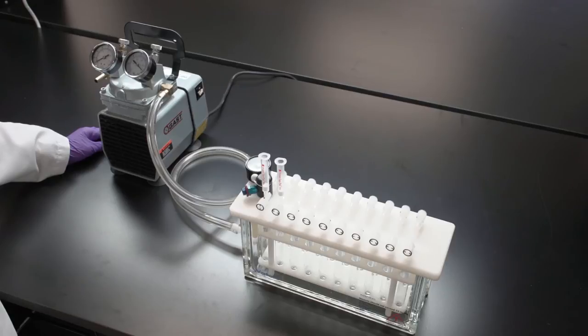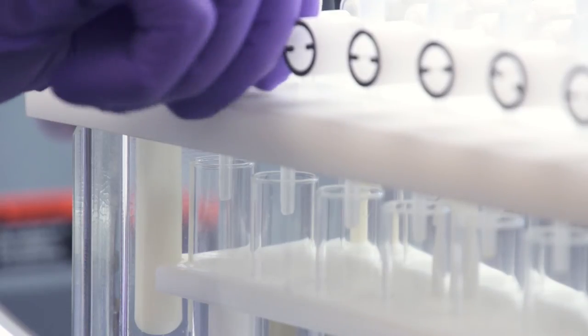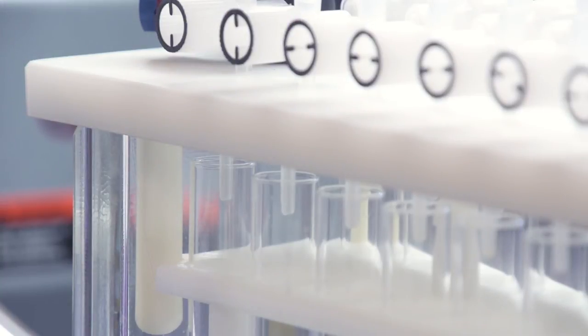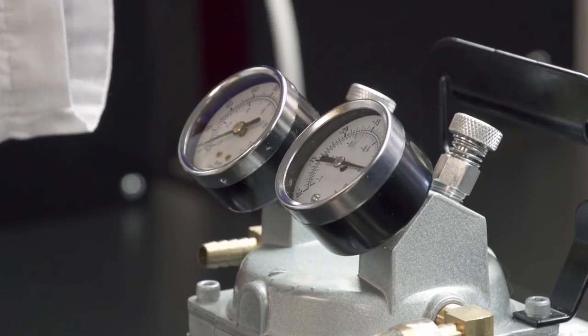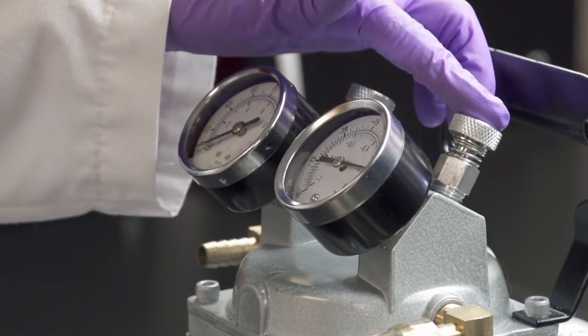Continue flow until all the liquid has been drawn through the cartridges. To ensure complete elution in the final elution step, turn all the stopcocks to the open position and increase vacuum momentarily two to three times to draw residual droplets through the cartridge.